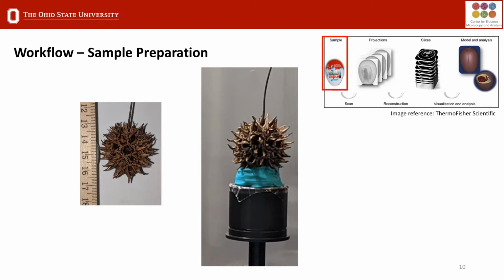When mounting a sample for microCT imaging, it is important that your sample will not move during the scan. Any significant sample movement during your scan will result in a bad reconstruction.